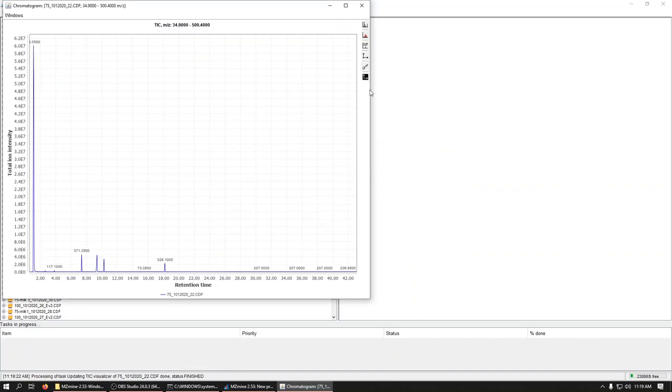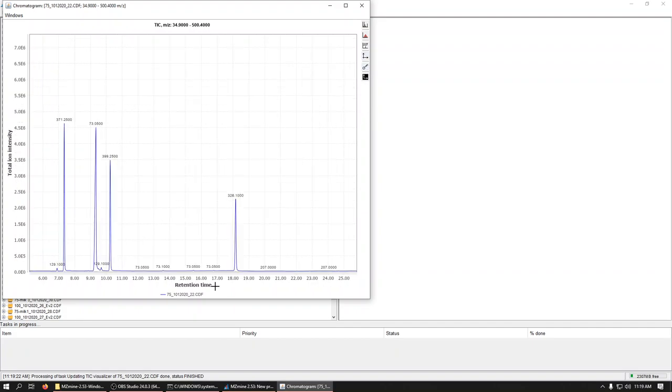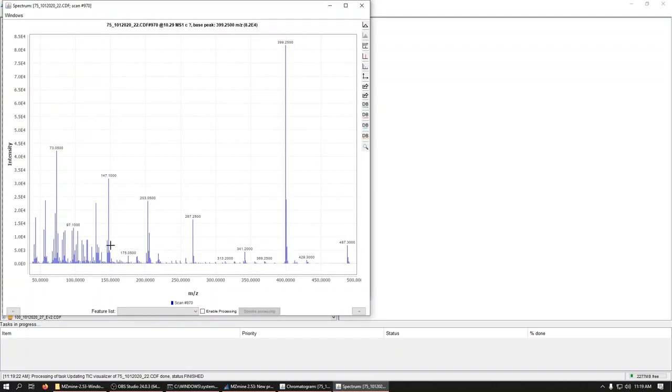And it'll draw it out. Here is the TIC of what we're seeing. And if we zoom in by clicking and dragging, we can look at our peaks. And if we double-click, we'll see the mass spectrum of that scan.